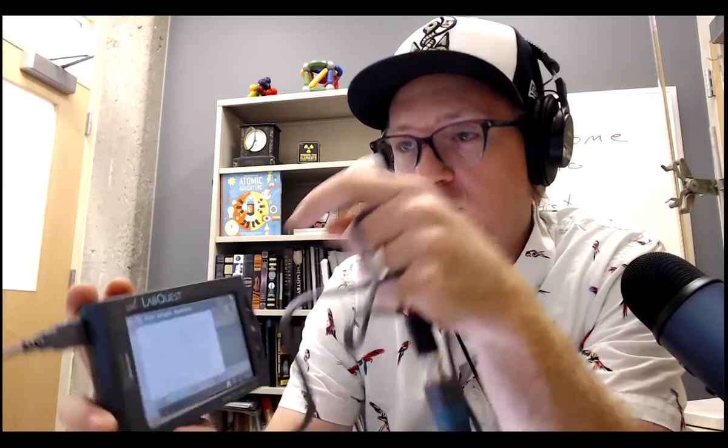And then you come over to the second tab up here. This is the data that you've collected. And then the third one is the XY tab, and it shows the data in columns. It doesn't show anything yet because we haven't collected anything yet. If we were ready to start collecting data, I would hit this play button down here, and then I would hit keep. You're going to keep your first data point. Every time you hit keep, you're going to have to type in the volume, and your first volume will be 0. So you can just type in 0 or 0.00. And now you'd be ready to start the titration.